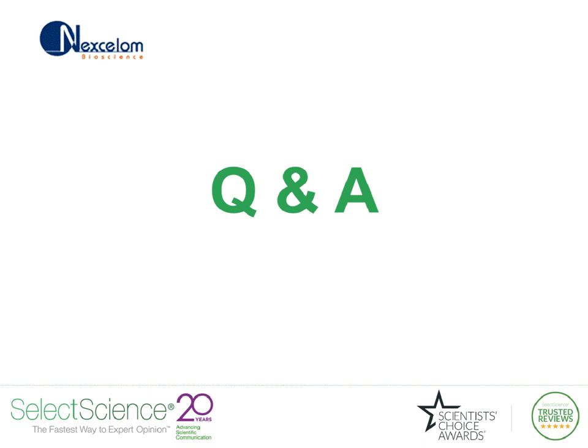Fantastic, thank you. Another question. Are there other problems with Trypan blue staining?